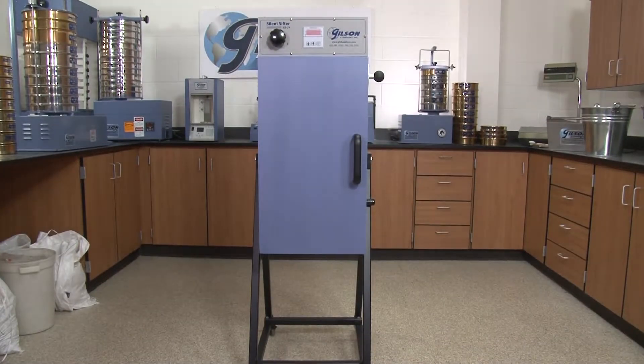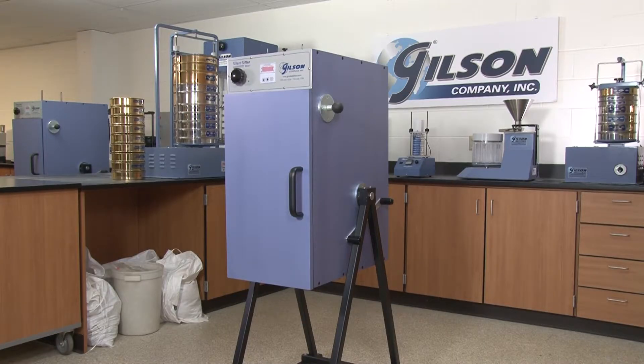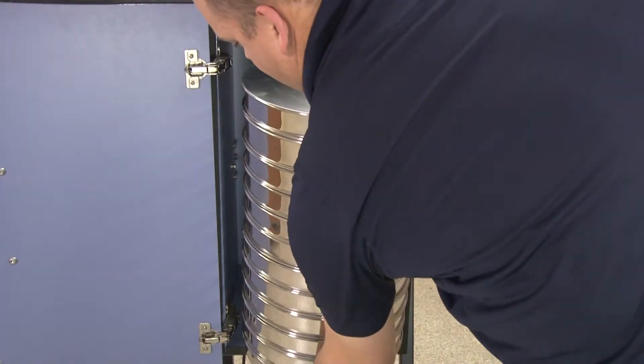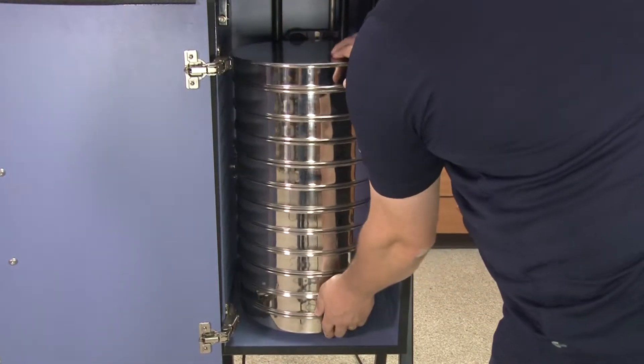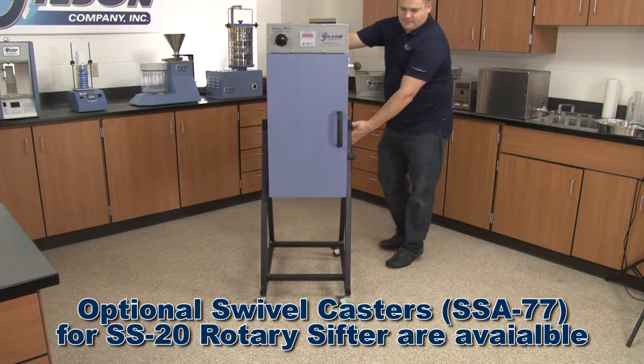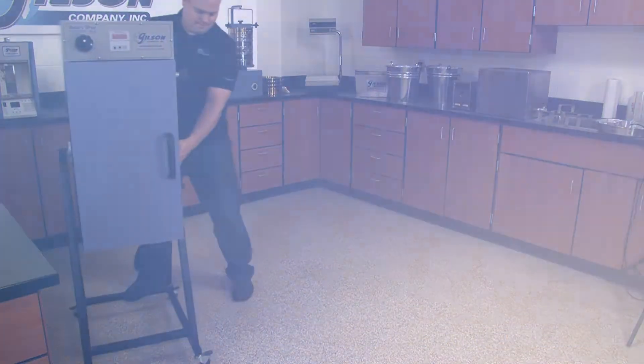The rugged cabinet of the Gilson rotary sifters is constructed with dense impact-resistant MDF board with heavy-duty hinges, allowing the door to swing wide open to a full 170 degrees for easy access to the unit's interior. The Gilson SS21 and SS22 come with locking swivel casters for easy mobility around the lab.